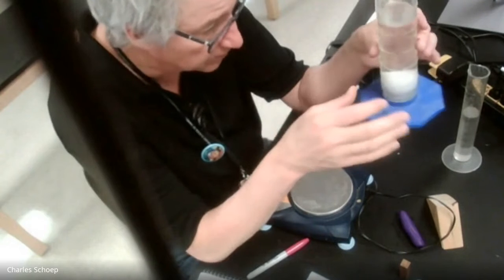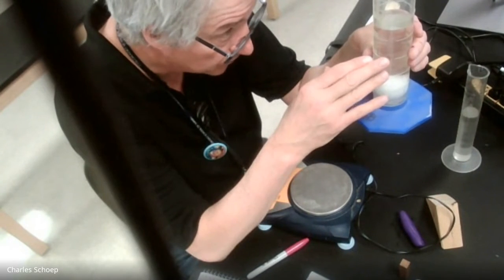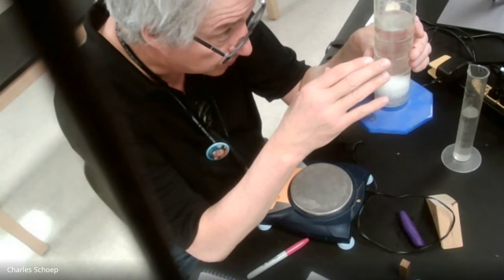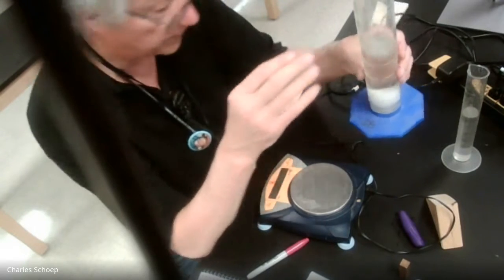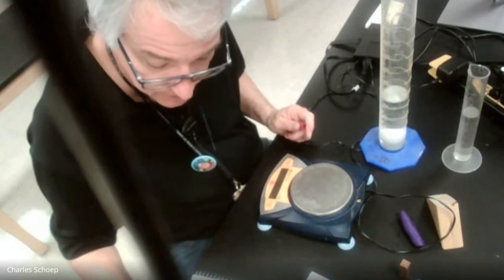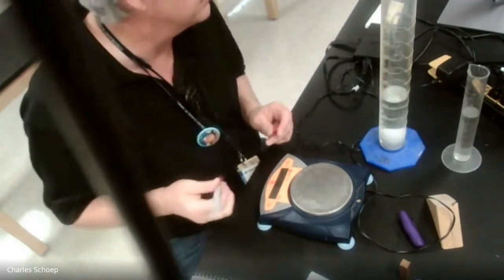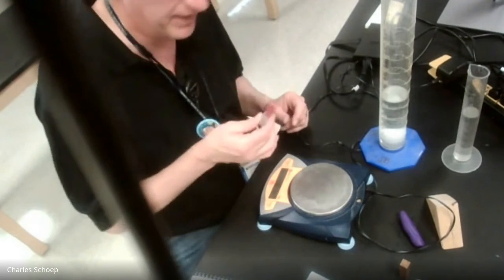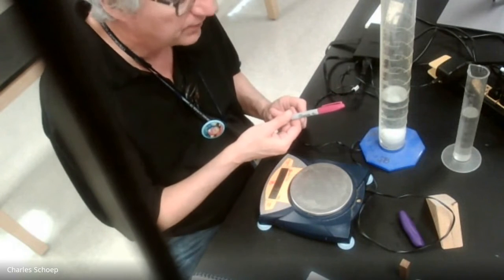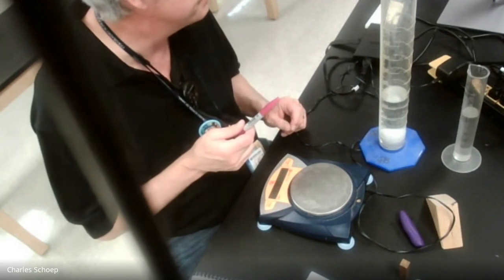And the volume went from 165 to 248. And I'm thinking, if we subtract, then we can figure out the volume.